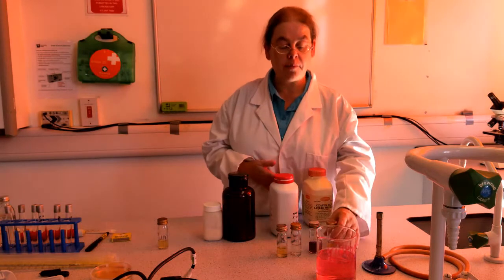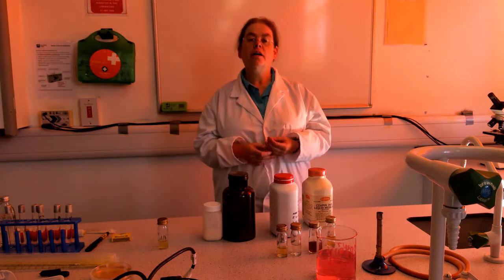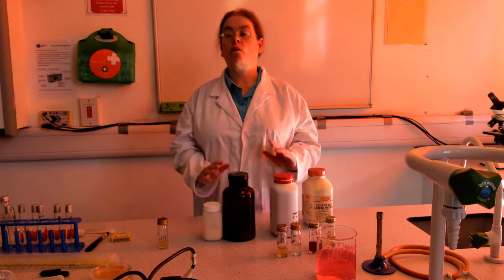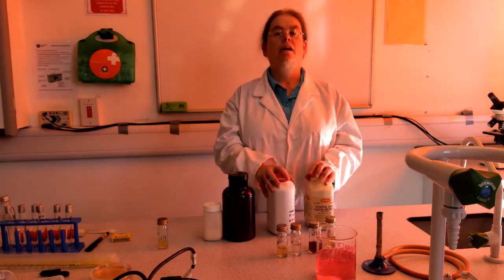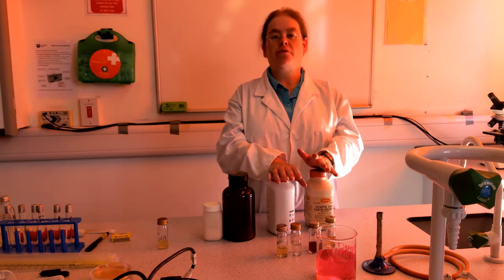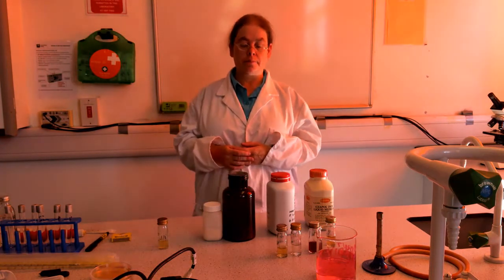So in the practical that you would have done, we would have worked with 4 different growth media and 2 different bacteria to identify the best growth medium for both of the bacteria. Now, we have 4 types of growth media that we would have tested. 2 of them are what we call complex media, which basically means they're made from living material. We don't know exactly what chemicals are in them.